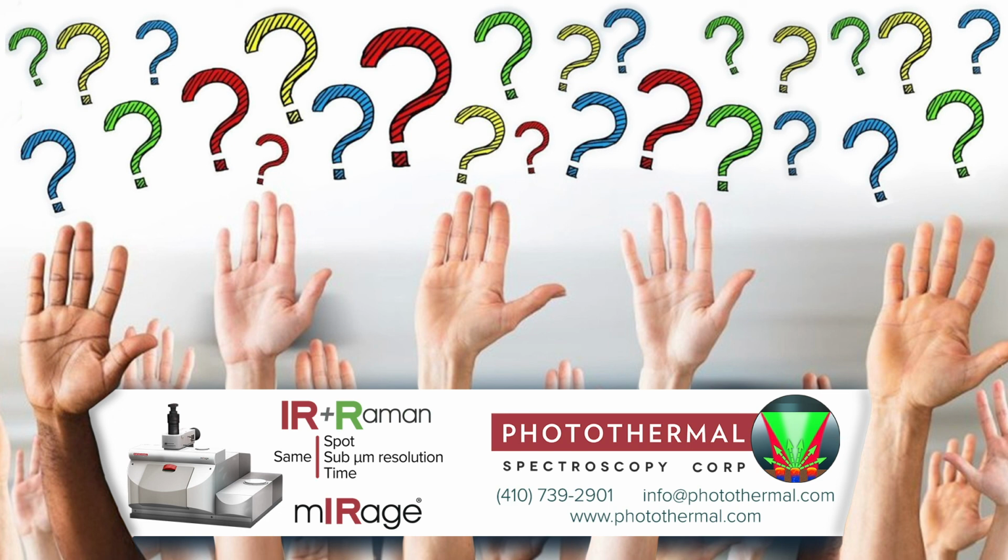So your spectra are in fact more pure, especially if you're measuring an inclusion that's, say, half a micron in size, 500 nanometers. You can now get spectra, chemical information, only from that one spot, hence pure spectra. Whereas if you did that with a traditional IR system, you'd be averaging over several microns. And hence, I call that sort of spatial blur coming into the spectra.